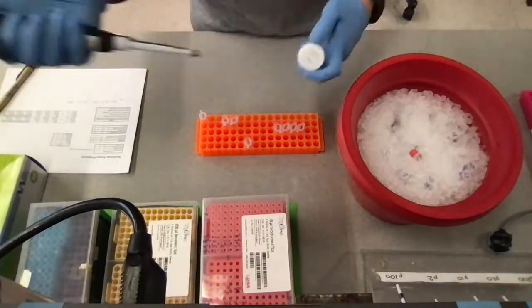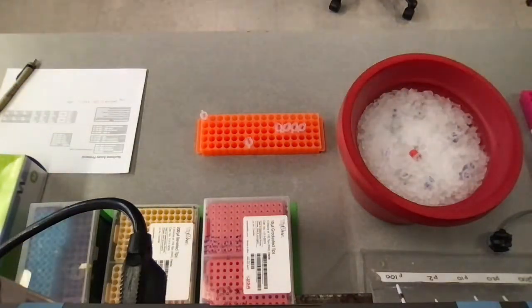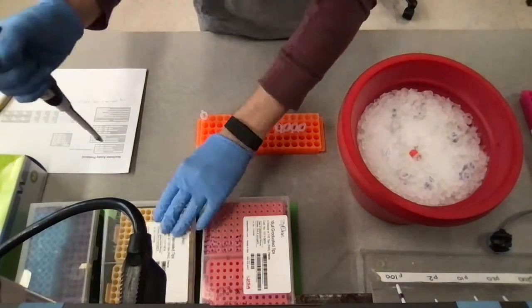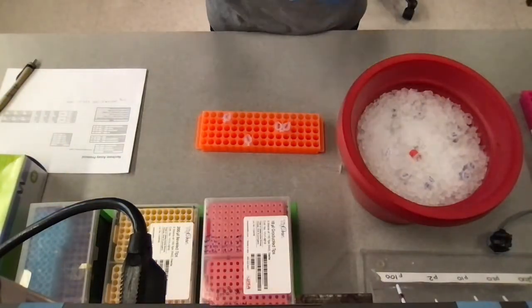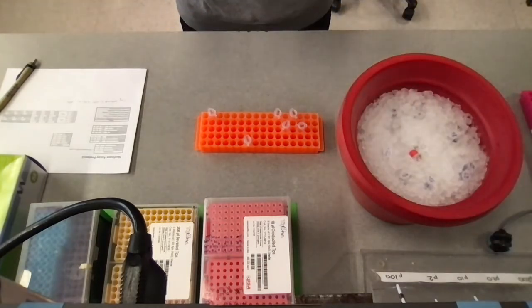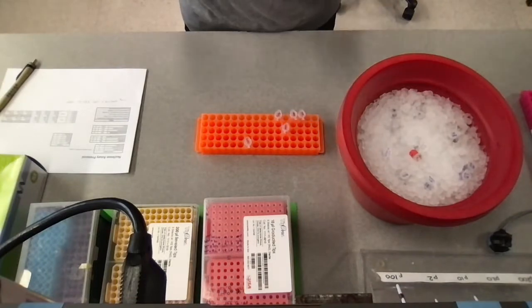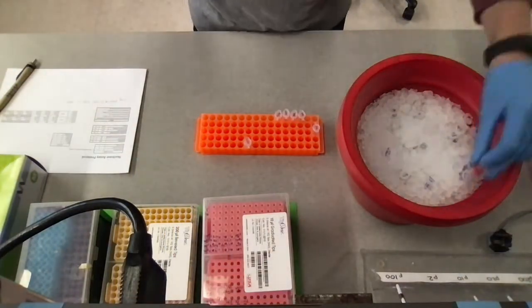After you get all the DNA and the proteins in the correct concentrations, we're going to go ahead and transfer those over to a plate so that we can put that into a thermocycler. For this experiment, we're going to be using 1 micromolar of each of our proteins and a DNA concentration of 50 nanomolar for the final solution.